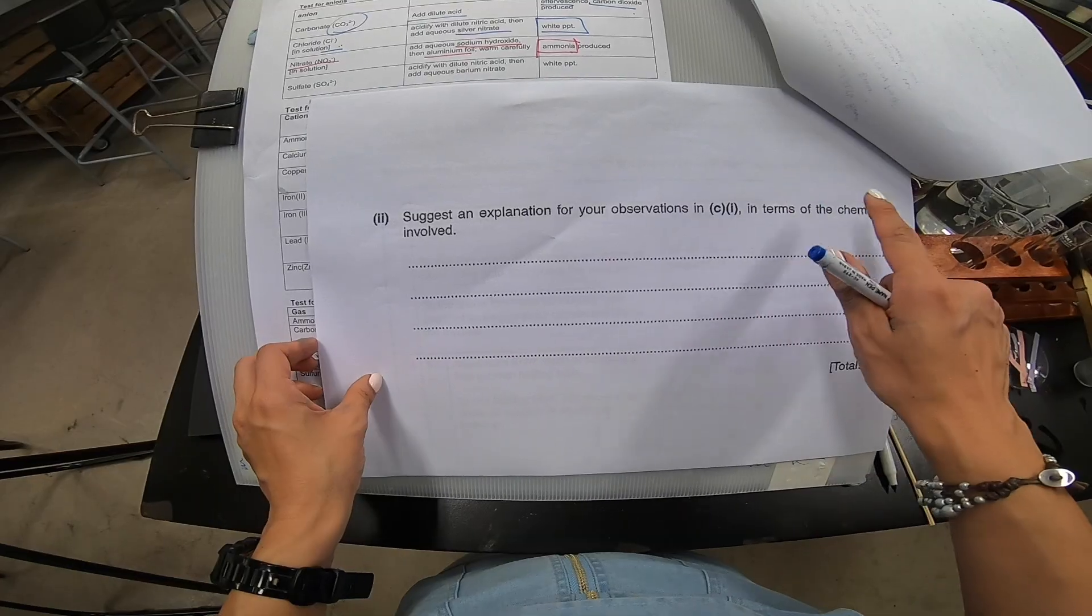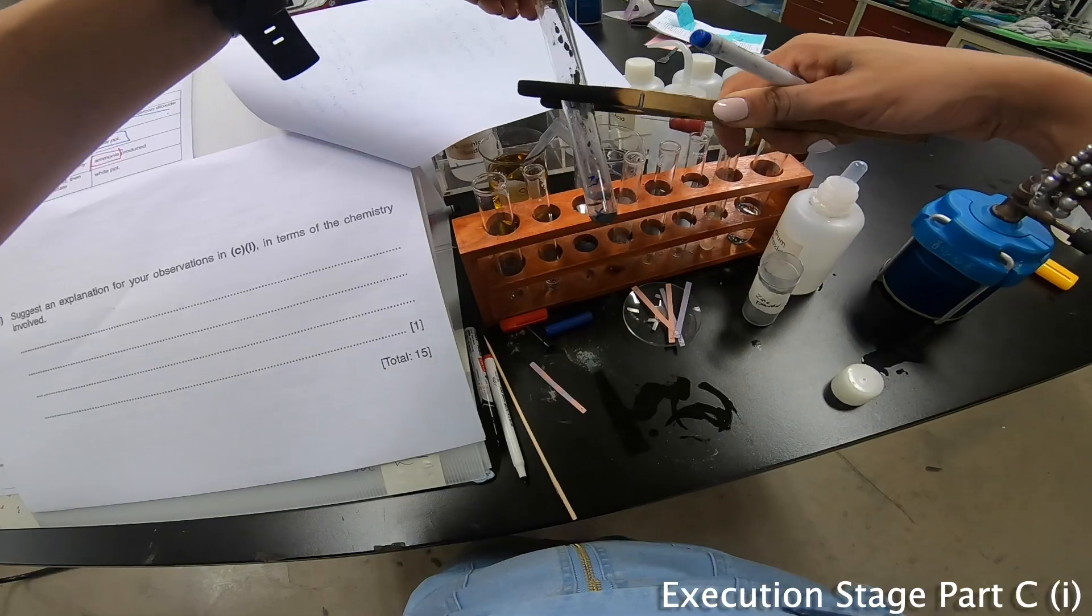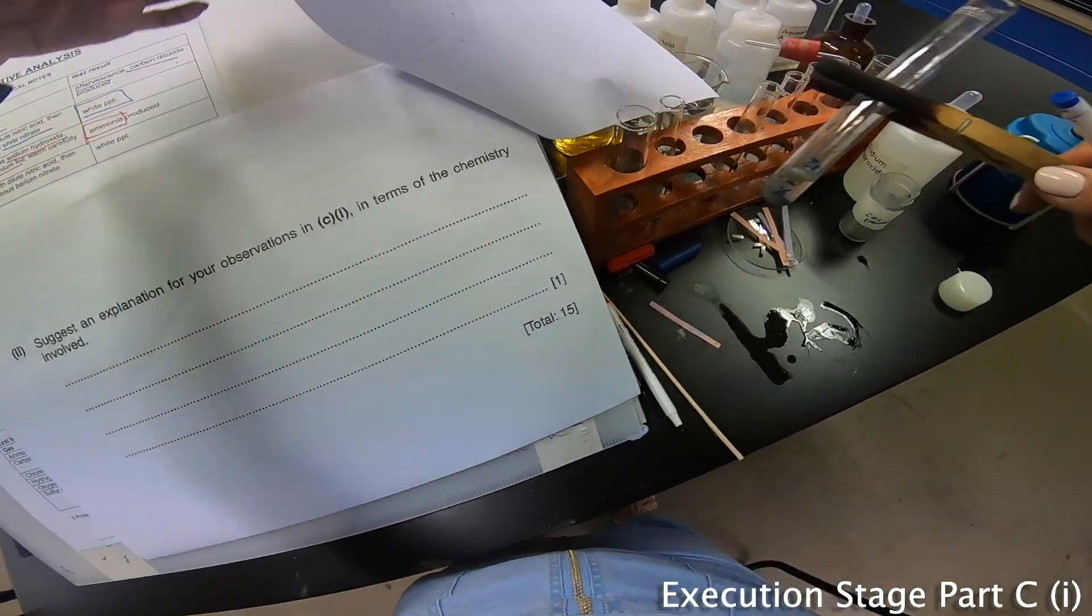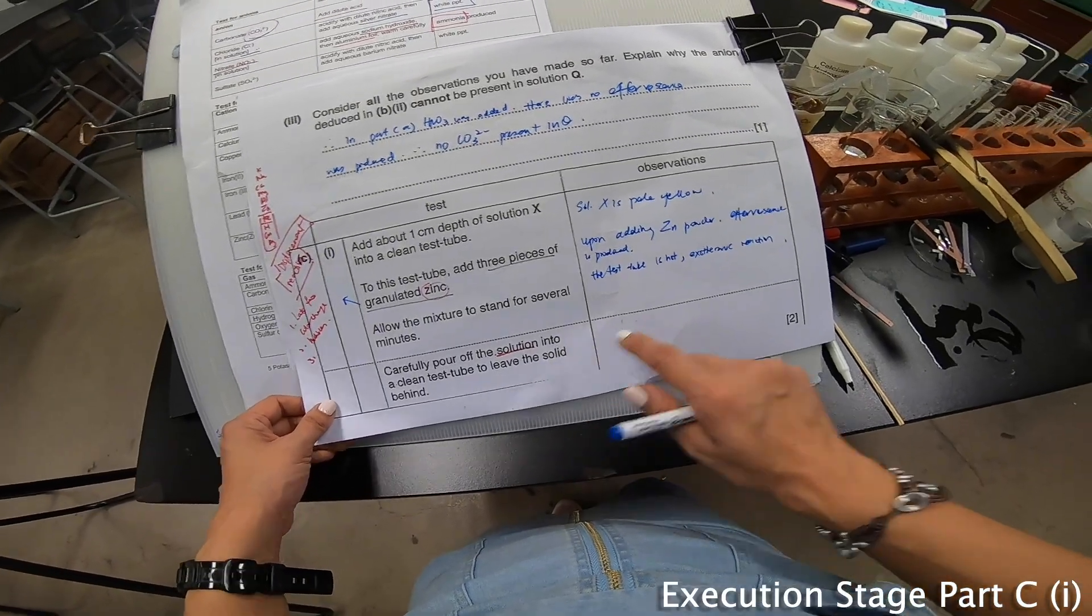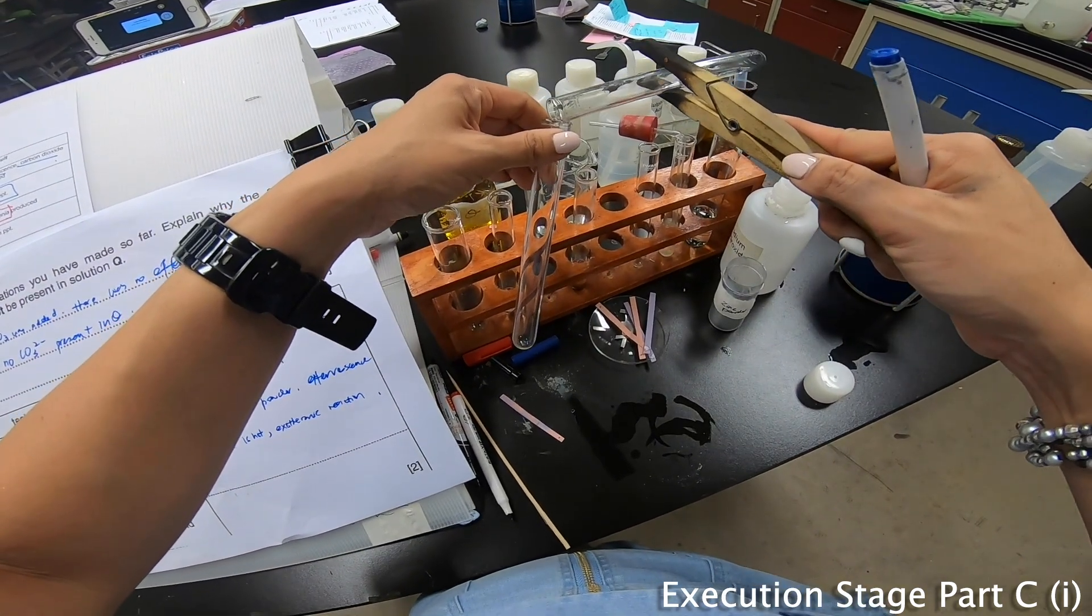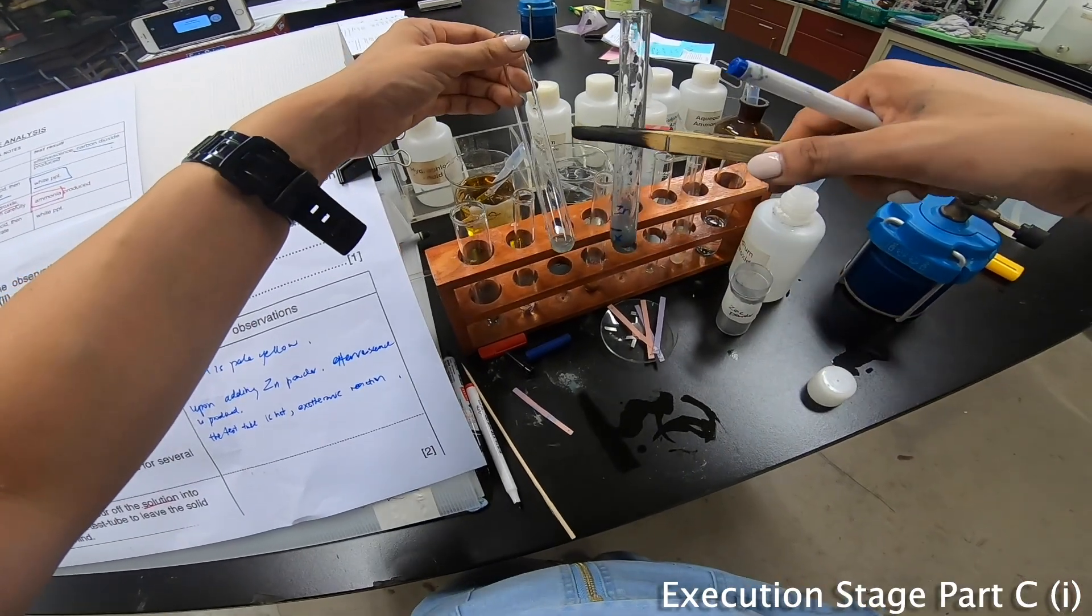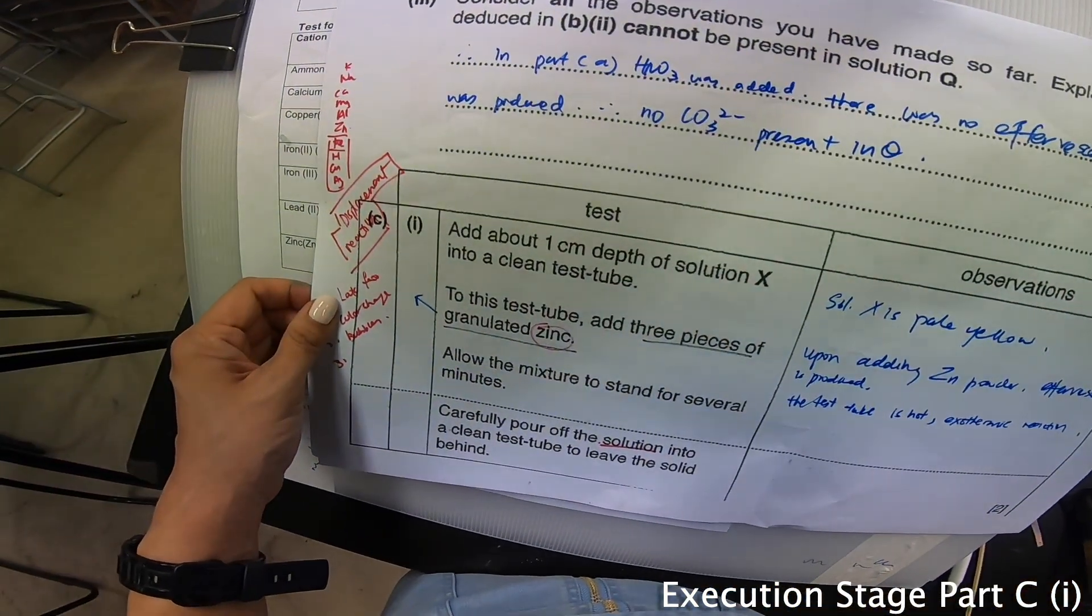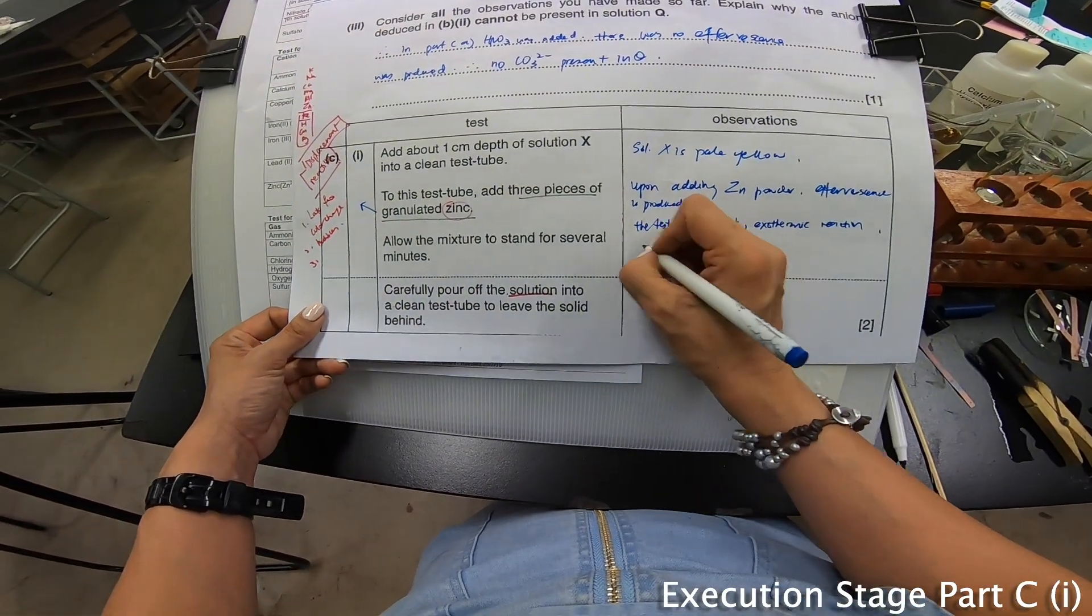Suggest an explanation for your observation in C part 1 in terms of the chemistry involved. Let's take a good look at our C part 1. You can see there is a color change. Carefully pour off the solution into a clean test tube and leave the solid behind. This is the clear solution, this is a solid. I'm going to write down what I actually observed in this part. Solution X became a clear solution. Zinc was left.